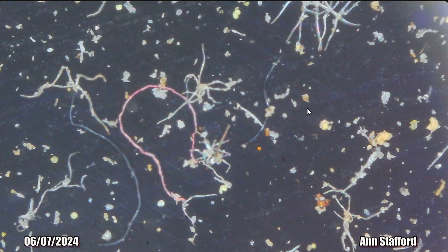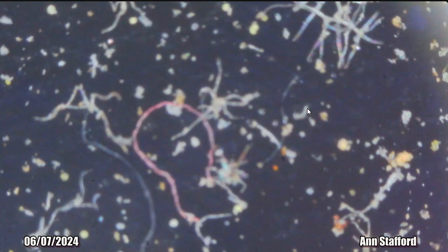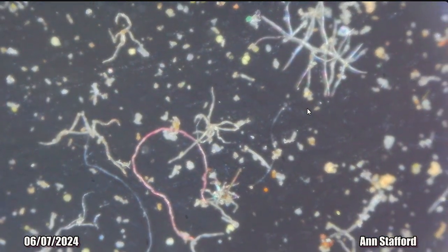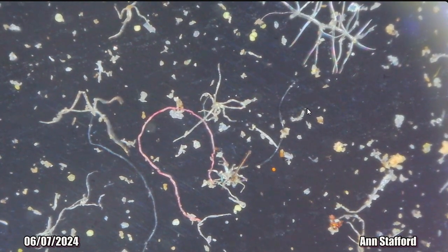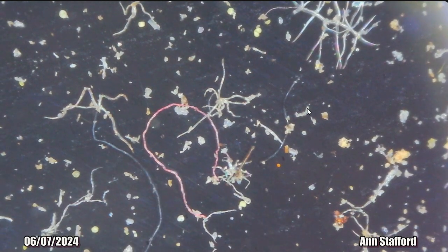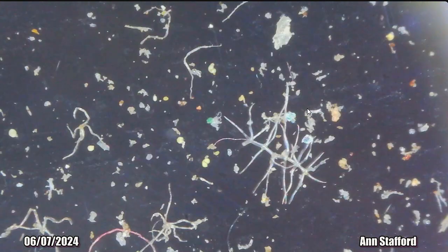And then I take a piece of glass. I buy cheap picture frames from the Dollar Tree and just take the glass out. I put the glass right on top of the dust, and then I set the microscope on top of the glass. So when I push down with the microscope, usually to focus it, because you have to hold it steady while you focus, it pushes the glass and it causes that movement. So these creatures aren't moving independently. That's me causing that. Just so that's clear.